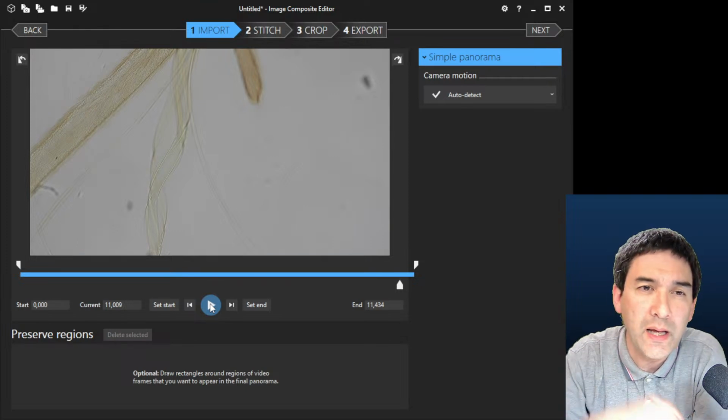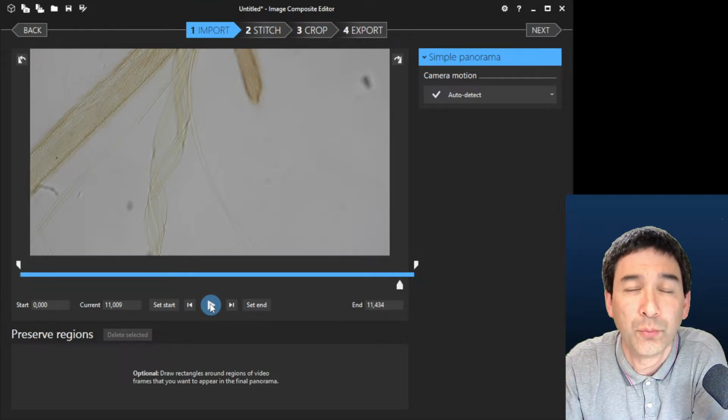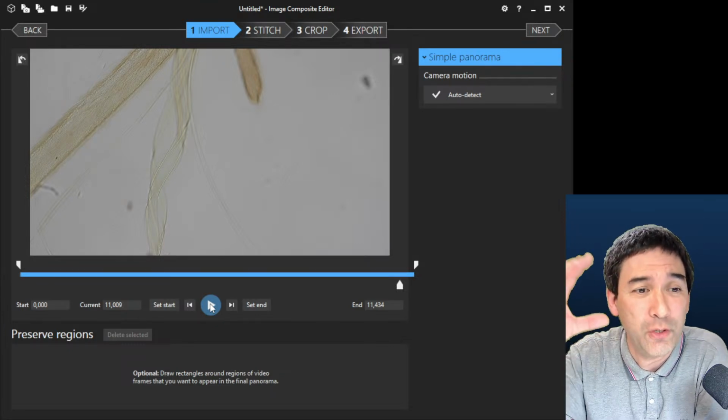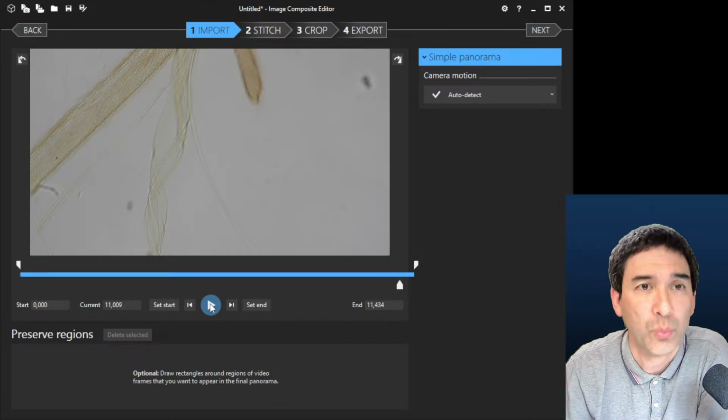The reason why I'm not moving horizontally is because the video would be too long and the processing time would be too long, and then you have to wait, I don't know, 10 minutes, 15 minutes, which is going to be too boring for the live stream. So I made a very short video simply to illustrate to you how this works, right?